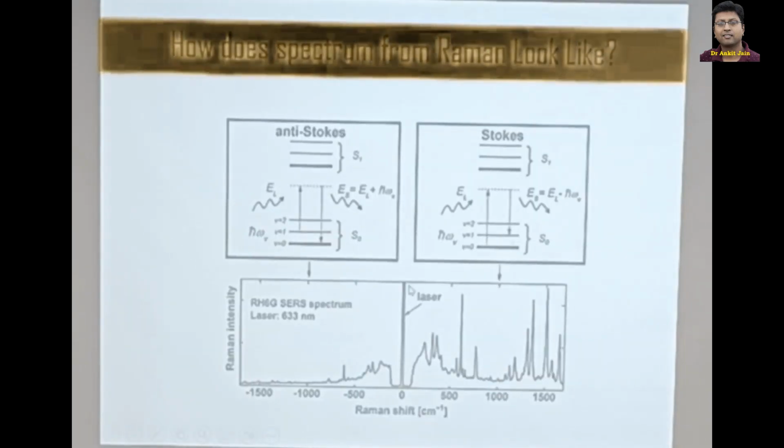This is the Raman spectra that we showed. This is our zero, where the notch filter zeros away the laser wavelength. And with respect to this, this is the Stokes and this is the anti-Stokes. So this is R6G, a rhodamine dye that is quite commonly used if we want to sense any kind of new samples or new substrates that we make, so that the intensity of the Raman is higher. R6G is usually a commercial dye that we can buy and test.